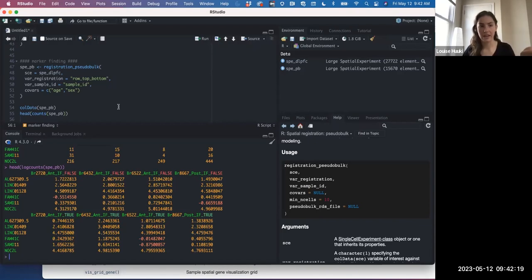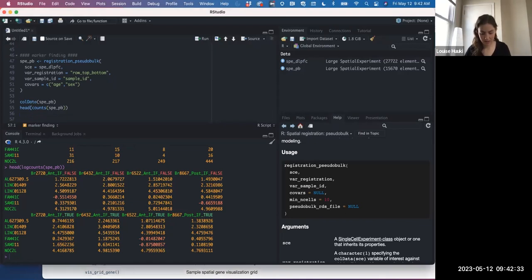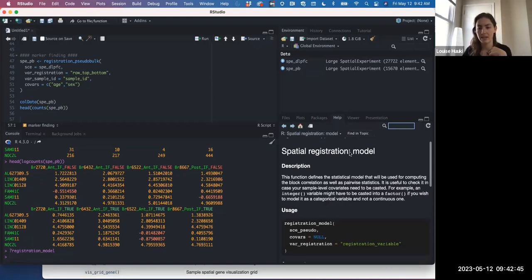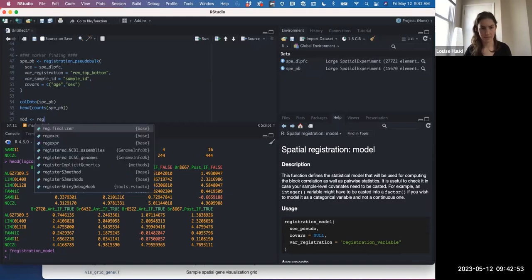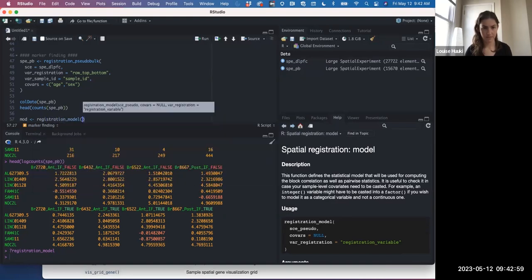You can do this whole process using registration_wrapper, which also runs the ANOVA and pairwise models. ANOVA tests whether there are any differences between the groups; pairwise tests compare individual groups, like layer 1 versus layer 2, layer 1 versus layer 3, and so on. Let's look at the enrichment output — it's a big table. We'll order by FDR for 'true' in ascending order to find the most significant genes enriched in the top group.